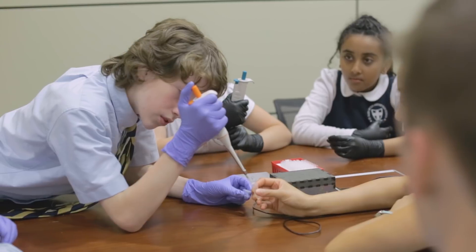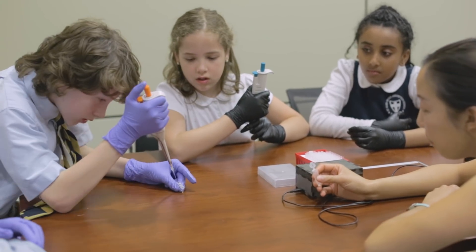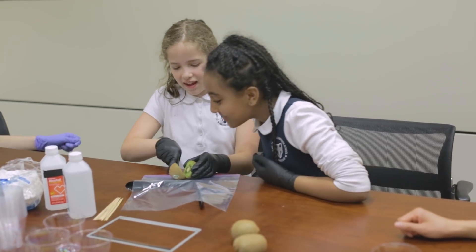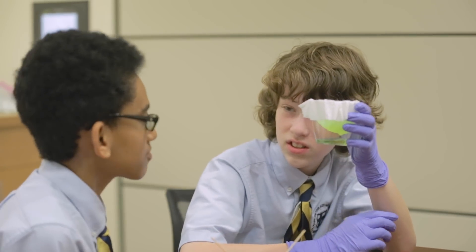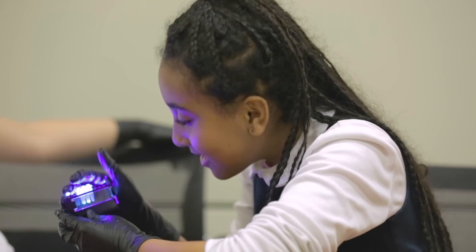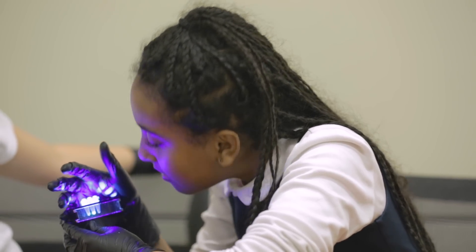Our effort has been done in very tight collaboration with Northwestern University, Mike Jewett's lab, and our team has included really talented grad students and postdocs from MIT and the Wyss Institute. From the outset we engaged as many educators as we could, both at the university level and outside. Mike Jewett's team has already integrated and tested their kits in the Chicago school systems. We actually put these reactions into the hands of K-12 teachers and students — their first time running the experiments — and showed that their results were comparable to experiments that I set up.